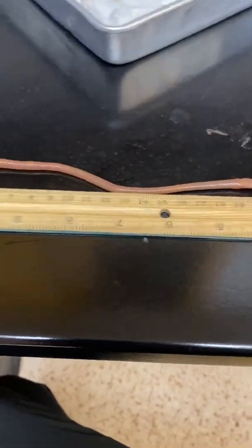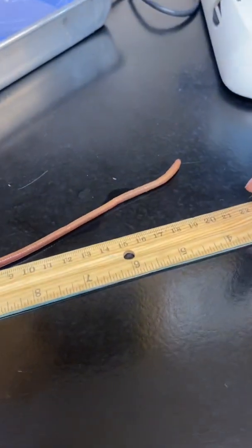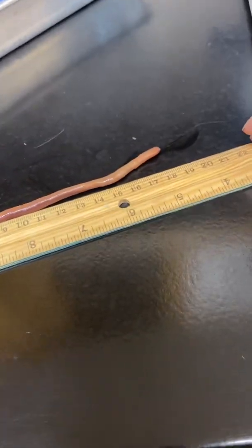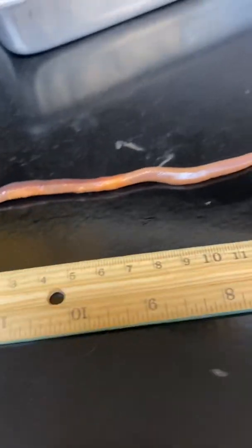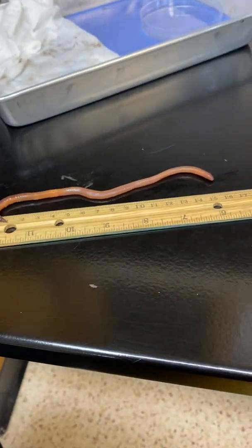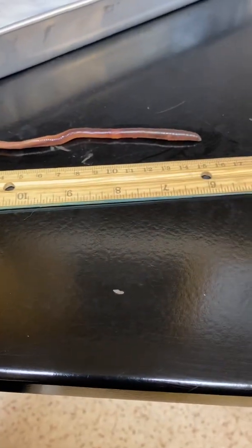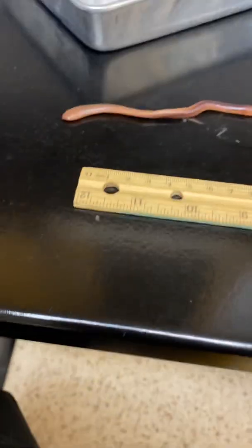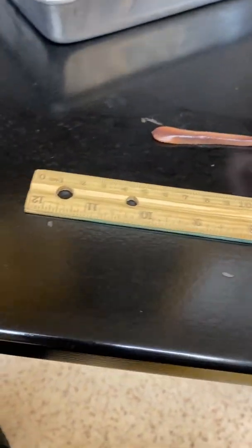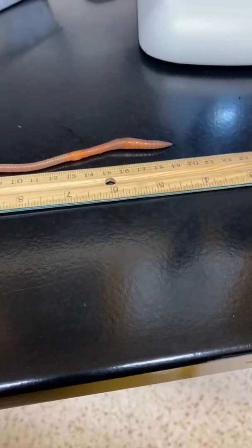So first one's about 20 centimeters. Second one's about 18. Third one's about 15. Pop them down again. Oop, that one's shorter. Let's put like 13, because he got pretty short for that time. Was that 4? I don't know. Put it down again. 19.